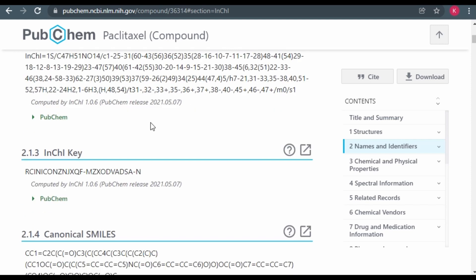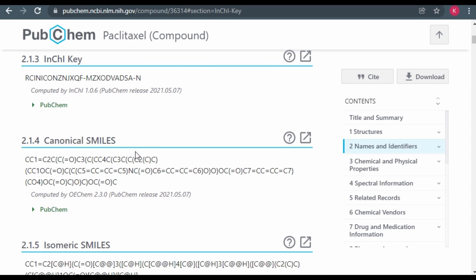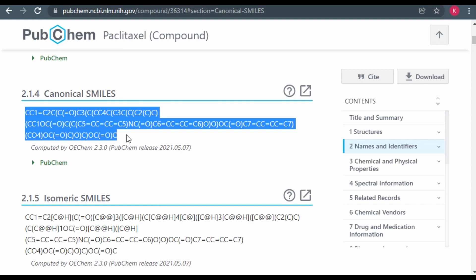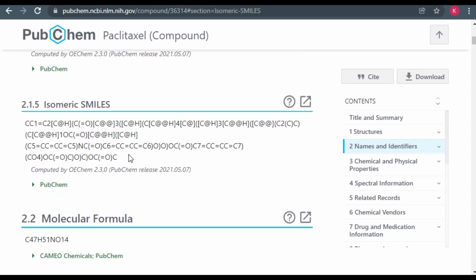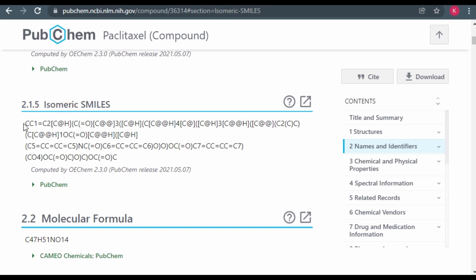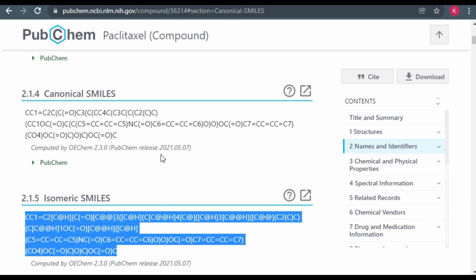There are two forms of SMILES. We have the canonical SMILES, which simply generate the basic structure without putting into consideration the stereochemistry — you just right-click and copy. But we also have a section for isomeric SMILES, which can be used to generate a structure putting into consideration the stereochemistry. So simply copy the isomeric SMILES and then go to ChemDraw.